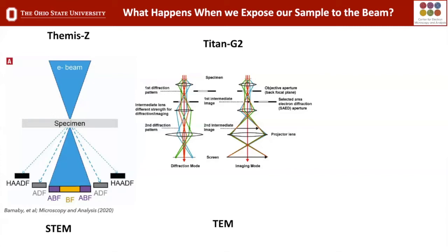In the TEM, or the Titan, over here in the middle, that's not always the case. So if you are a little bit older and have read the literature, anything before 1995 or 2000 that you saw was pretty much all HRTEM. Anytime you saw any type of atomic resolution image, that's what it would be. HRTEM is not directly interpretable.